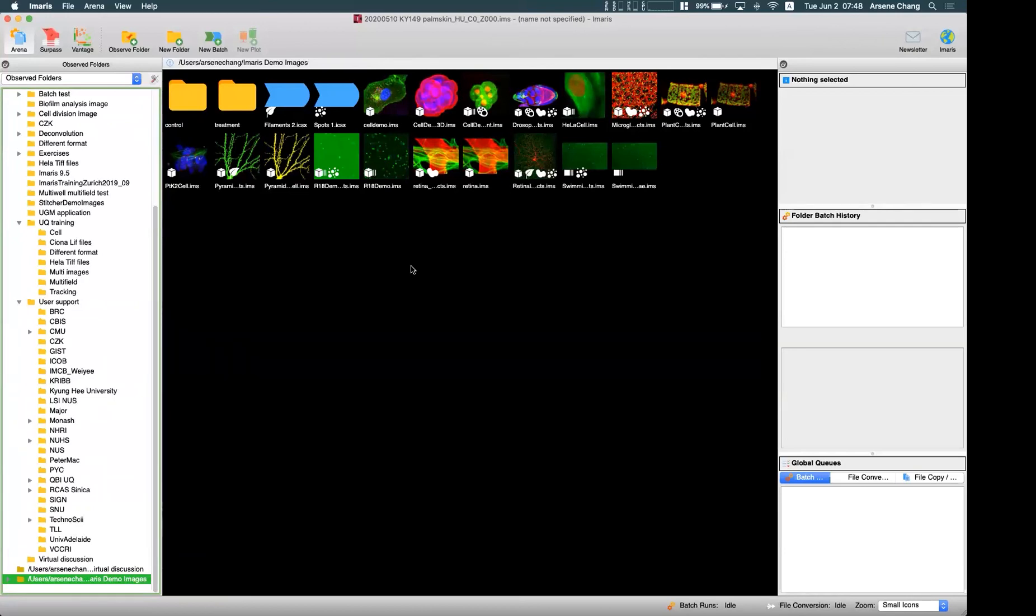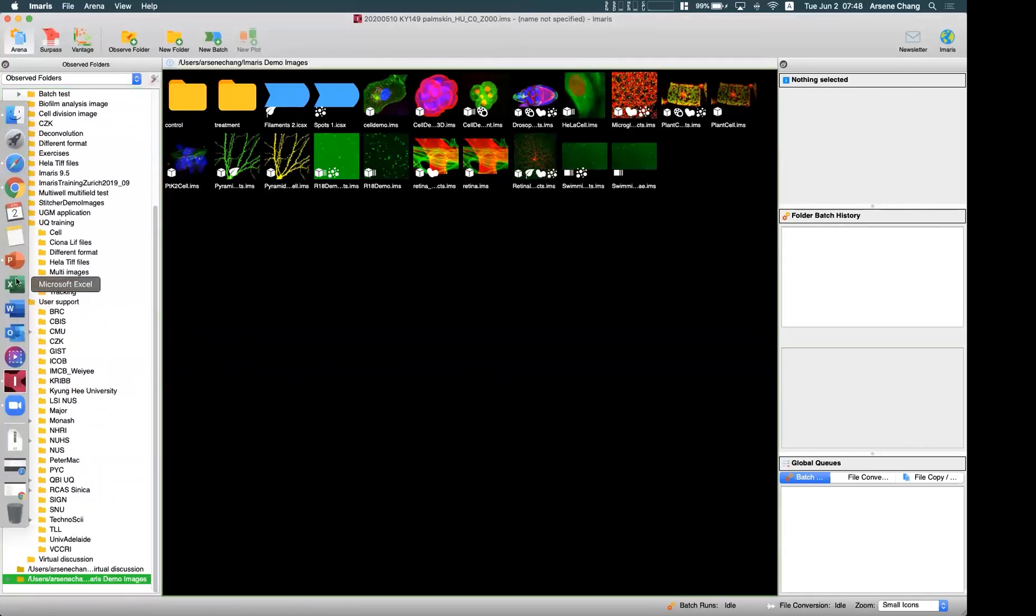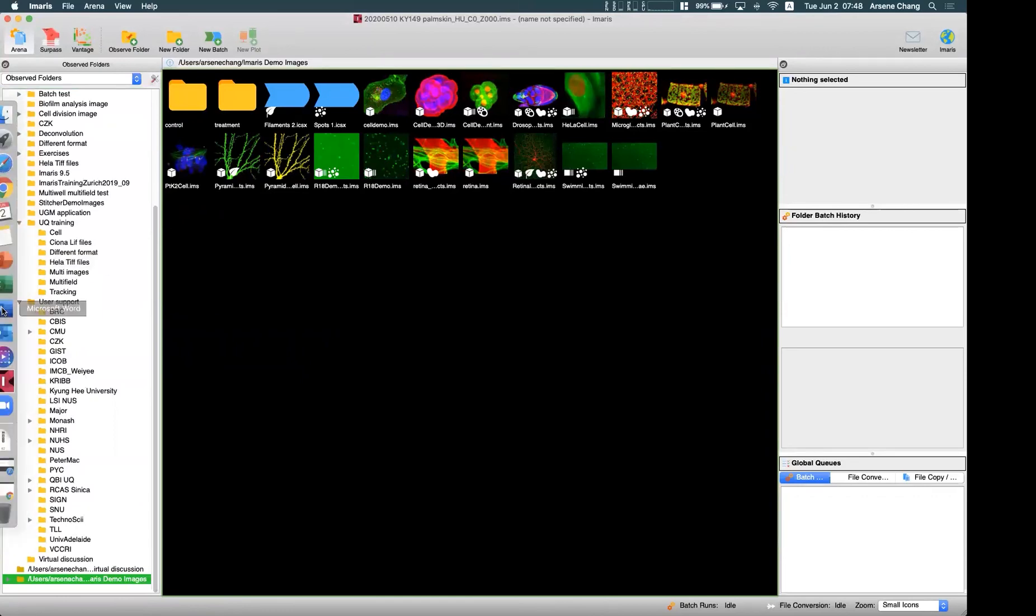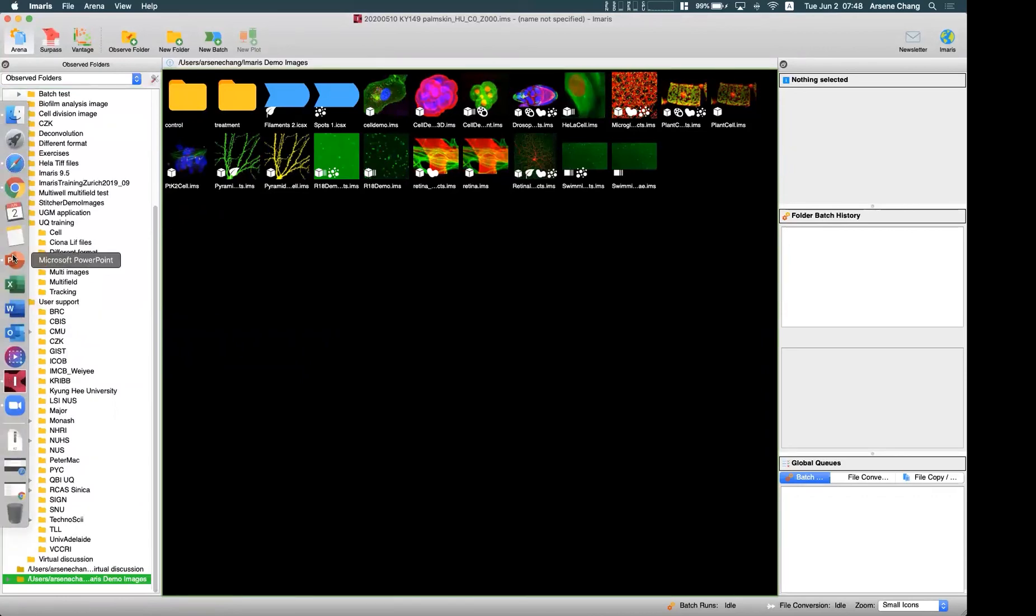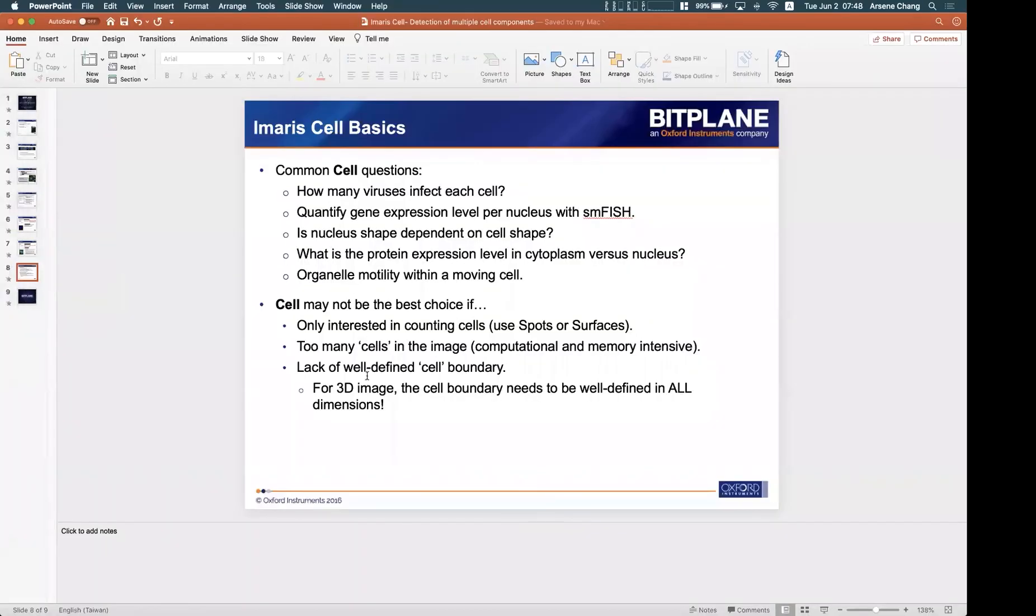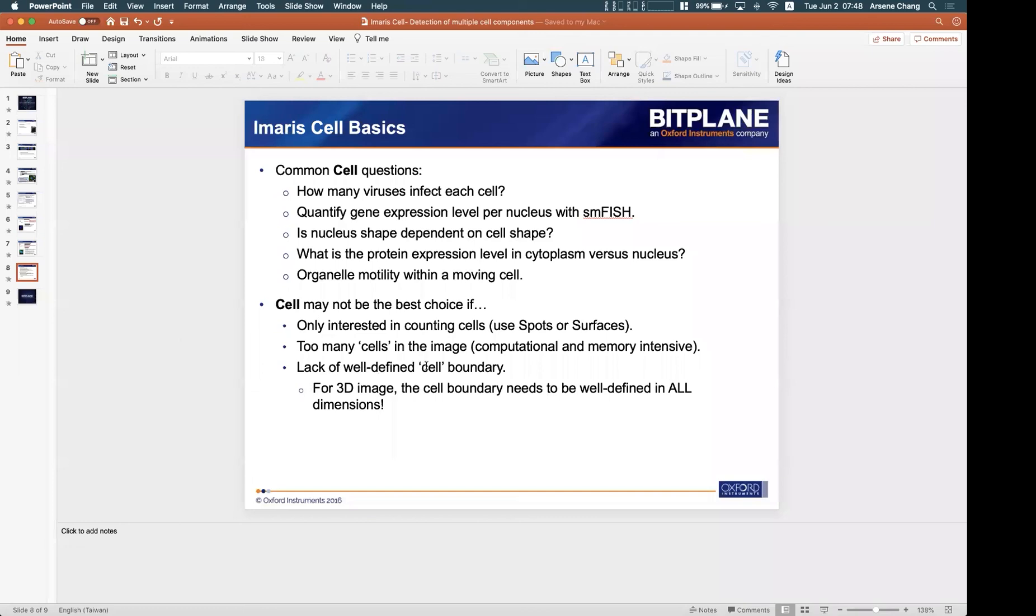So whenever you see that kind of strange volume rendering, then that should probably be due to the lack of well-defined cell boundary. So in that case, the cell algorithm may not work well.